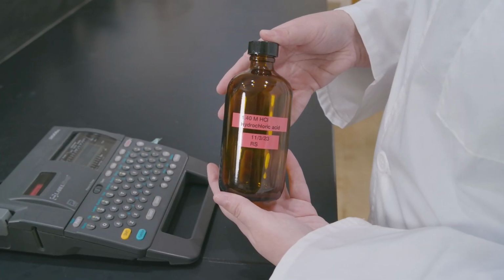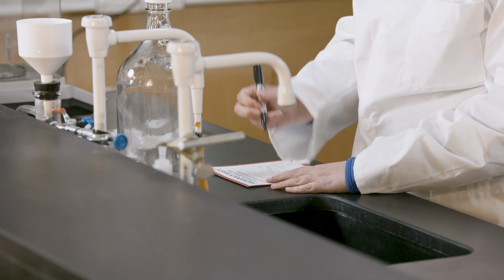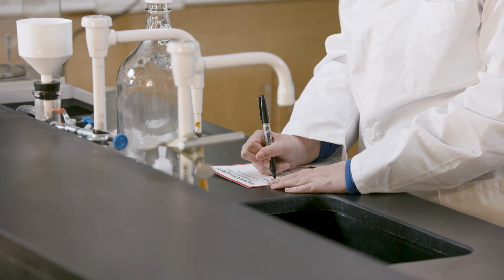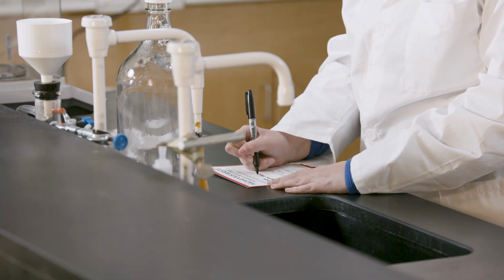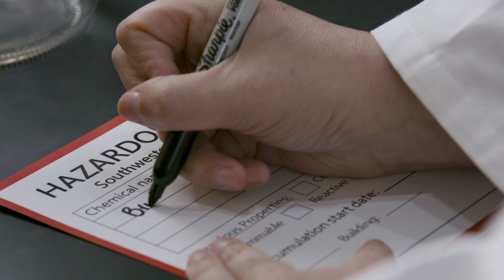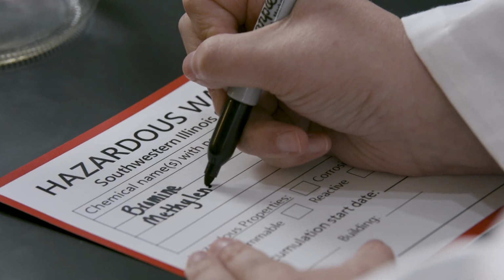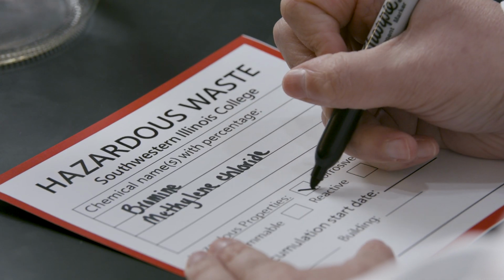But what about labels for chemical waste? This would include any products that cannot safely go down the sink after a class. These labels are equally crucial. They should be adhered to the container and in plain sight to provide important details to the students. The labels should be filled in prior to class and containers set out so students can use them. Labels should include the following: the start date of collection, to track when it was first used, the location of where the hazardous waste was collected or kept, and always check all relevant warnings as well. We don't want to miss any potential dangers.